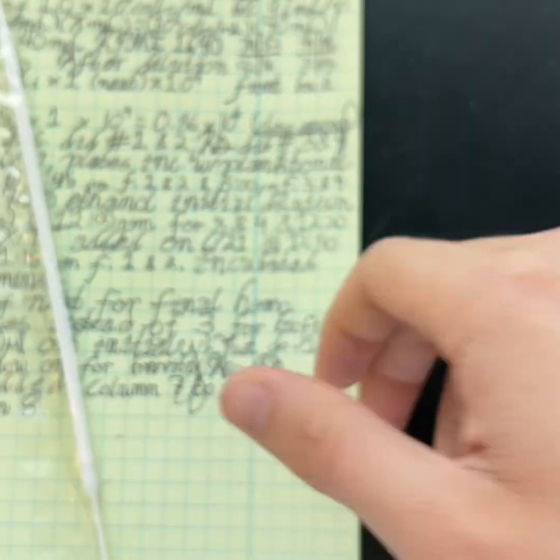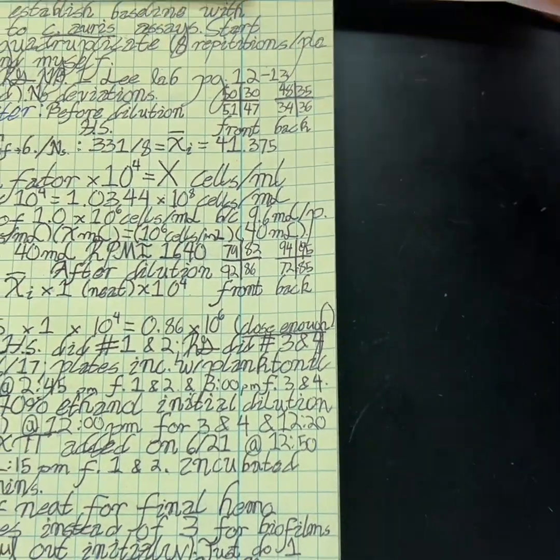And hopefully after you grow that at 37 degrees Celsius for a day or two, you will have isolated colonies. They will appear beige, slightly raised, very round, small, quasi E. coli. Okay, after you have streaked your plate, you can take an isolated colony.